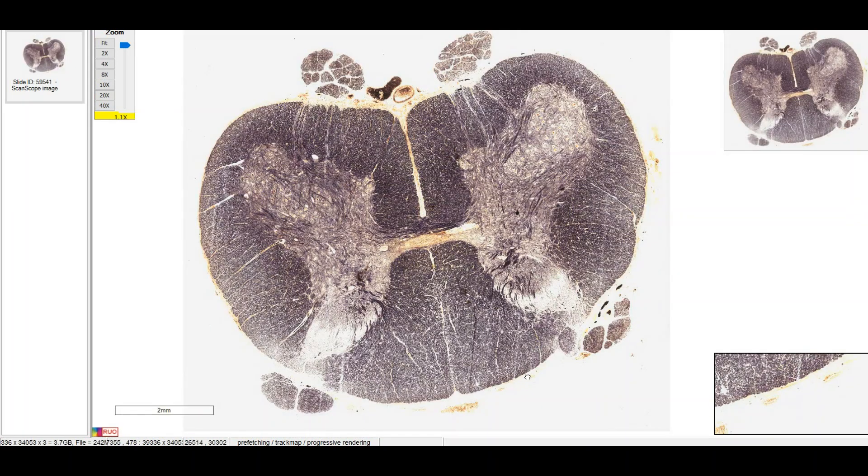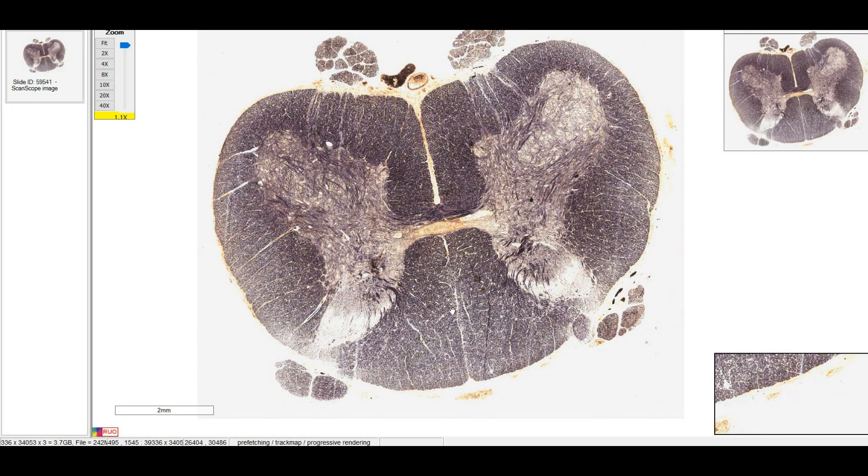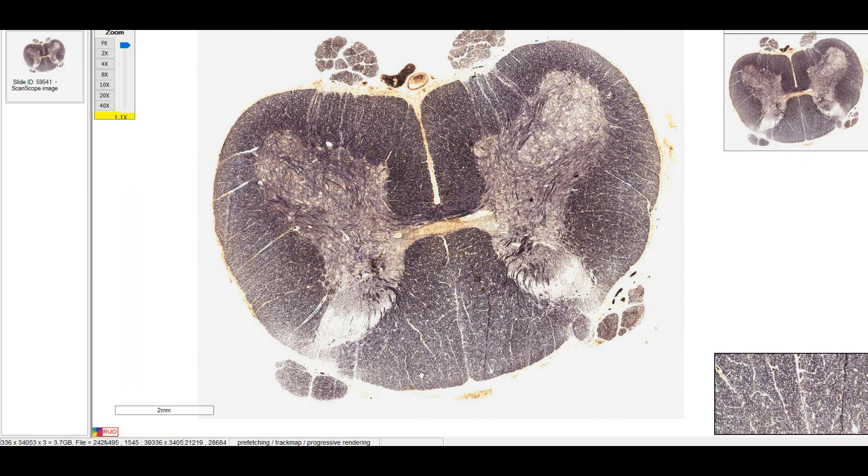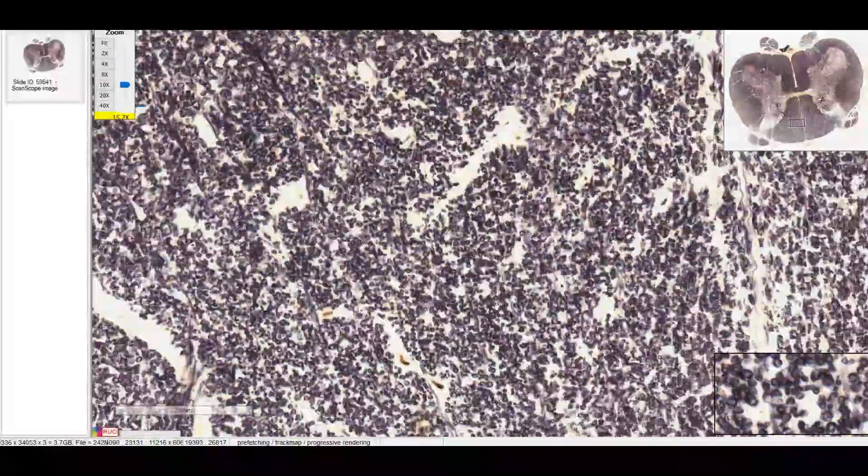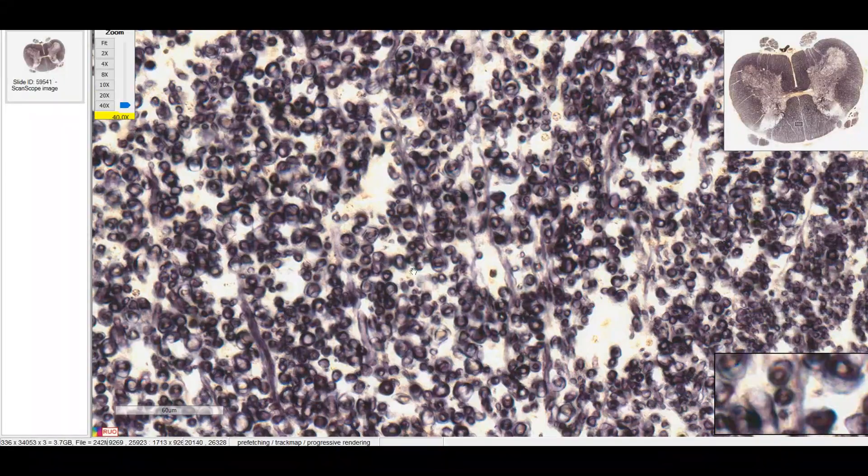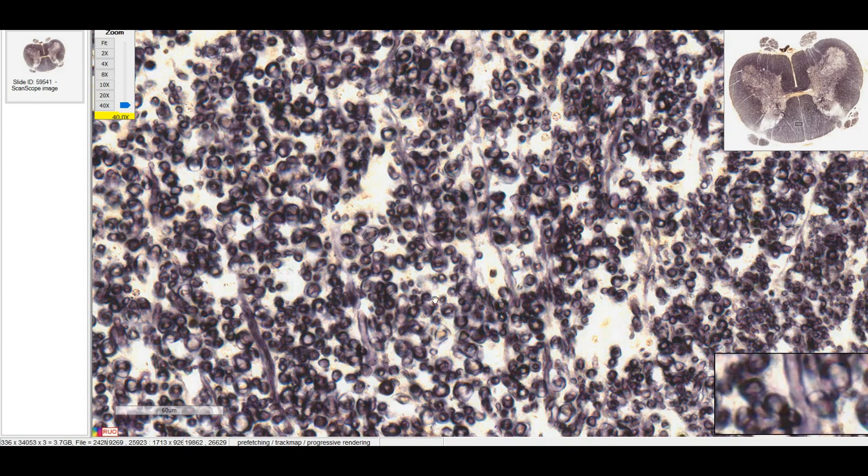This is another slide that's good for looking at myelin. It's actually staining specifically only for myelin. Looks like dorsal is actually down here. So I'll zoom in. You can see all these rings of myelin. And the cross-sections of axons would be in the middle.